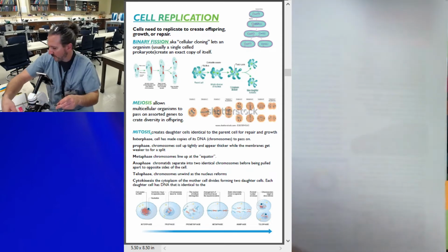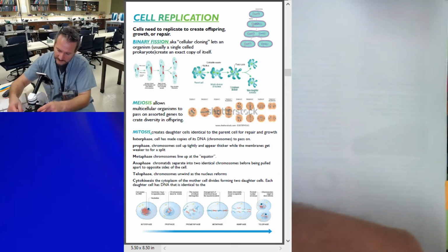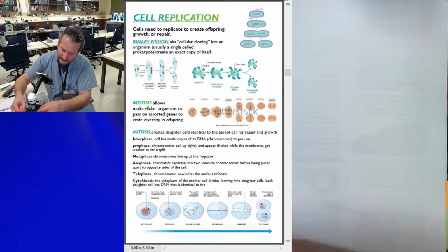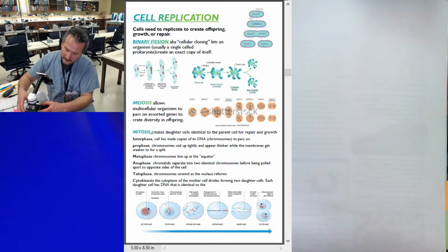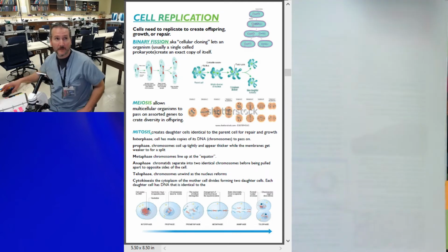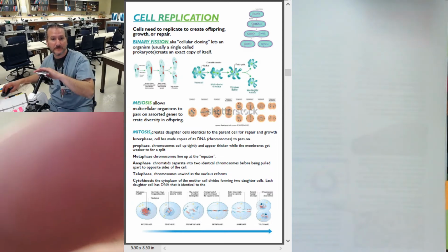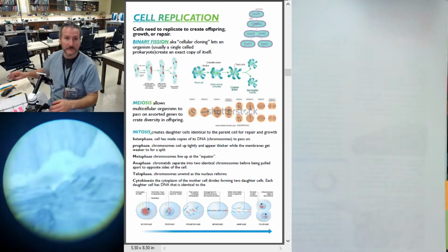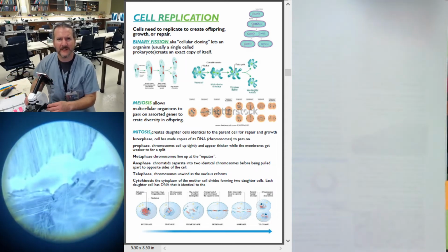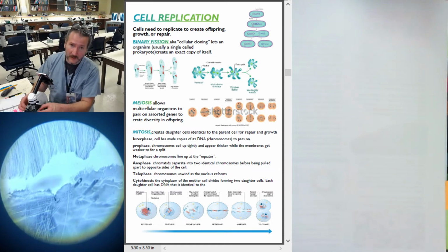Bring my other slide out. Going down to my scanning again. Lift up the stage clips, pull it in, turn on my scope. Right away, there's some onion. Oh, maybe not.